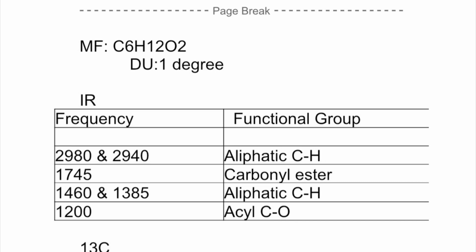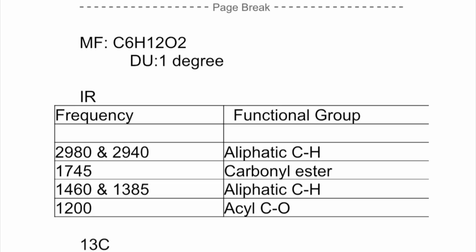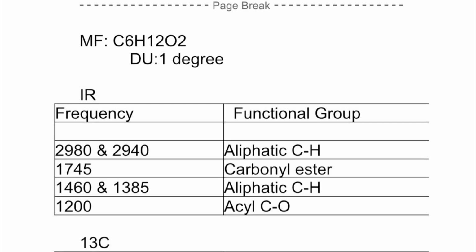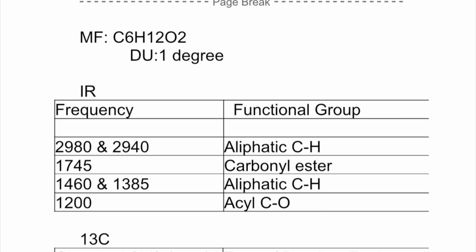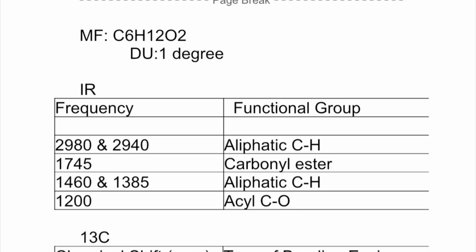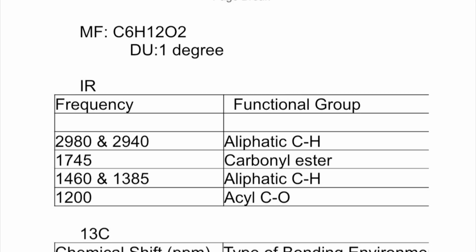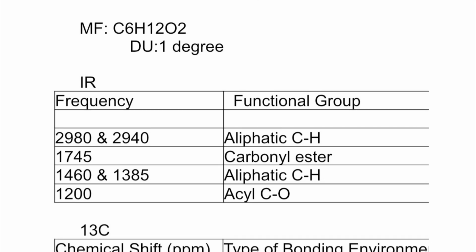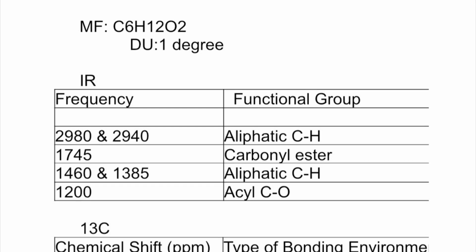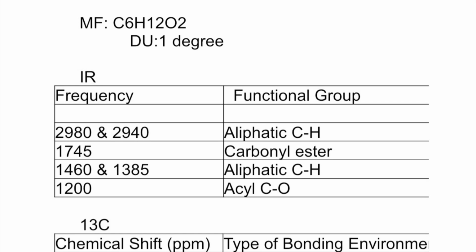So based off what you see, it is clear from the 1H NMR spectrum that it does not contain aromatic protons in the molecule, due to the absence of signal chemical shifts in the 8 to 6 range. It is also clear that the chemical shifts from 4.5 to 1 show peaks and splitting patterns, which are characteristic of aliphatic hydrocarbons.